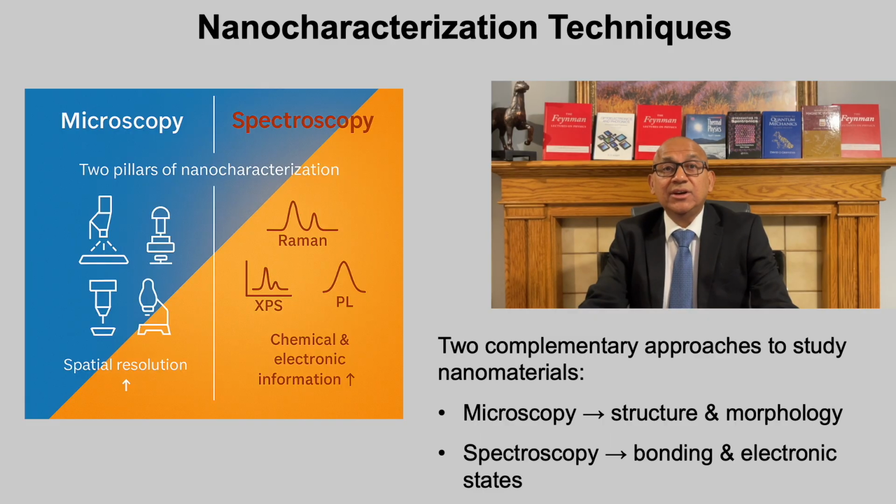In this lecture, we will explore microscopy-based techniques such as XRD, SEM, TEM, AFM and STM. In the next lecture, we will turn to spectroscopy and functional characterization, where light and particles reveal chemistry and bonding.